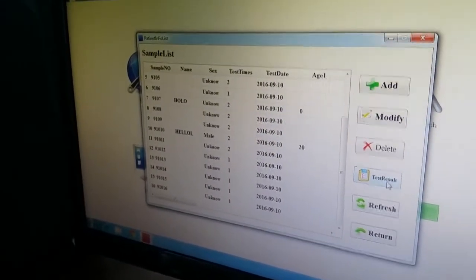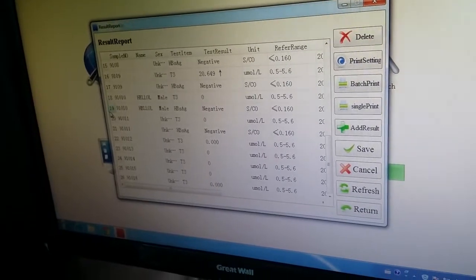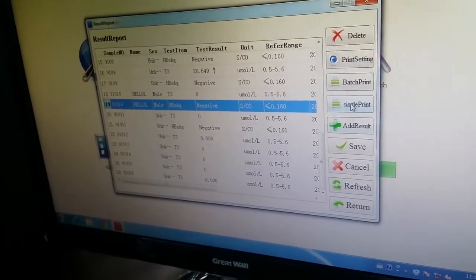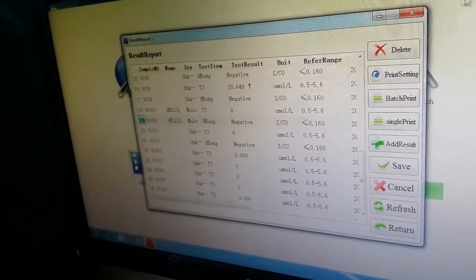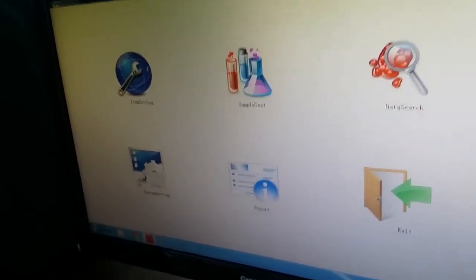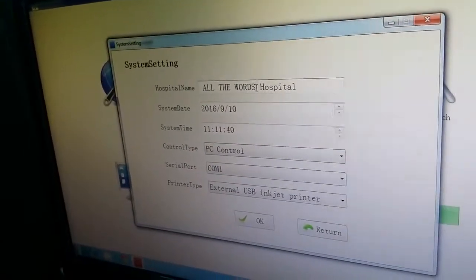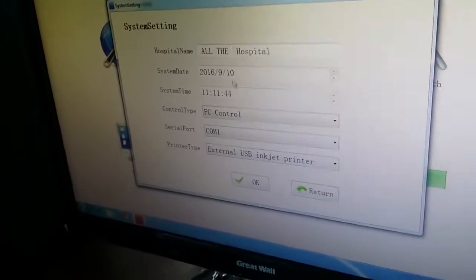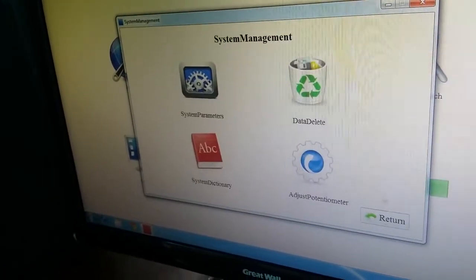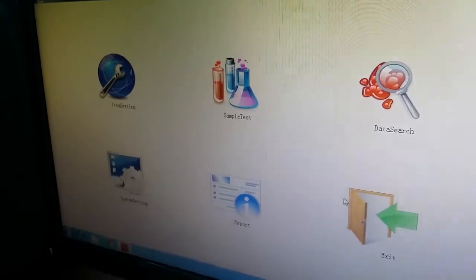From here, press Test Results and you will see the updated report. If you want to reprint, select it and press Single Print and it will be printed. If you want to add the hospital name, return and go to System Settings, then choose System Parameters. From here you can enter your hospital name and other details, then press OK. After that, when you print the report it will include your hospital name.